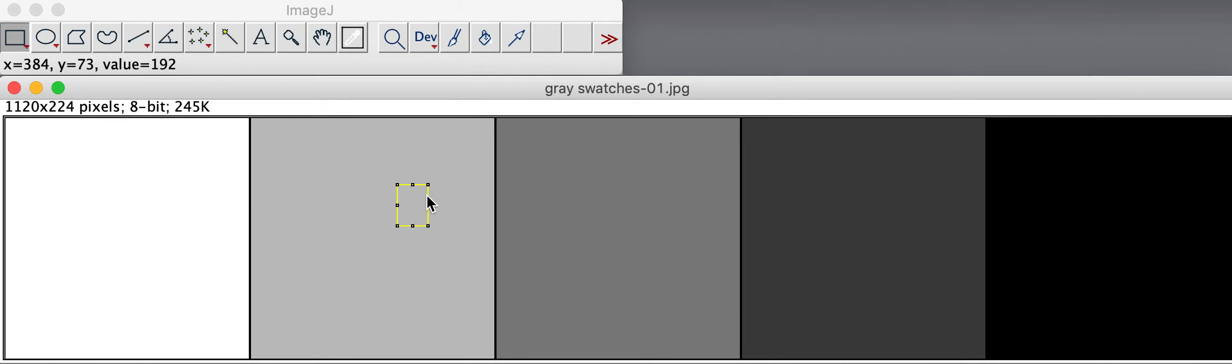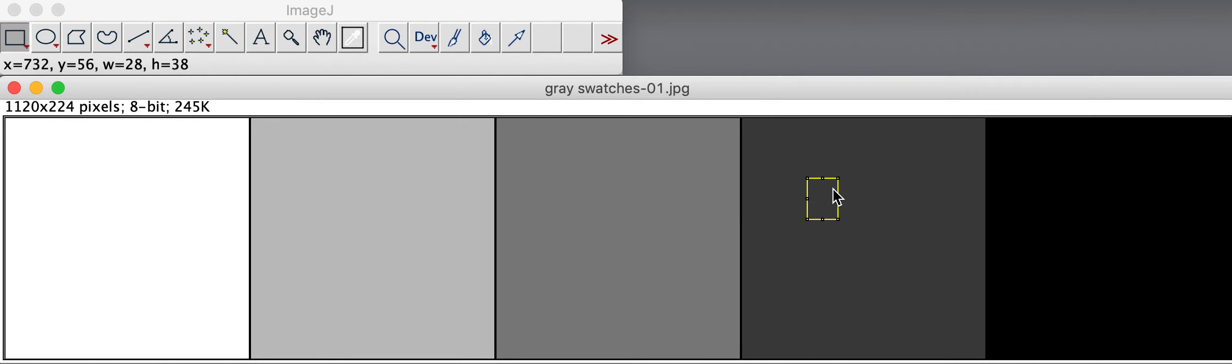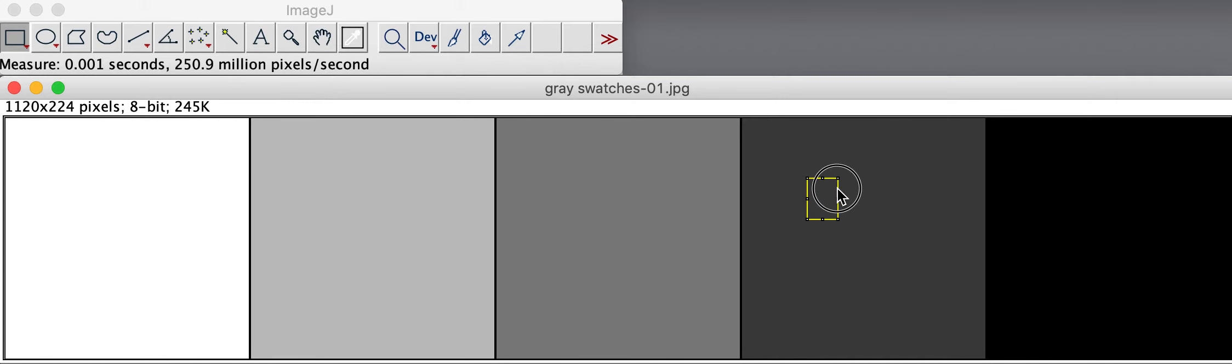So then we move it a third time. Measure. A fourth time. Measure. And one more time in this example. And measure.